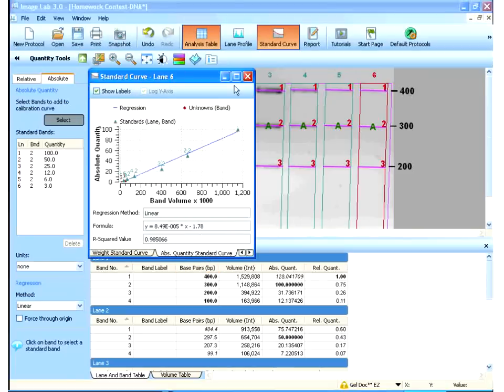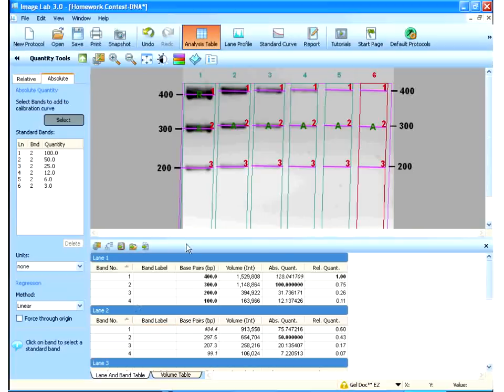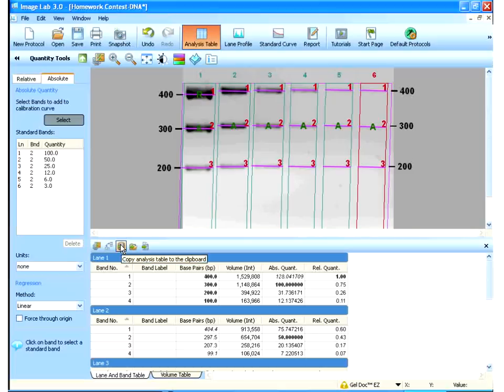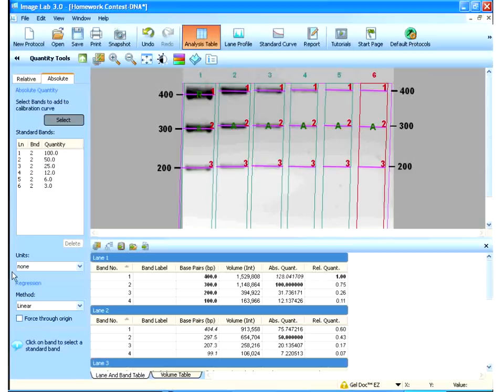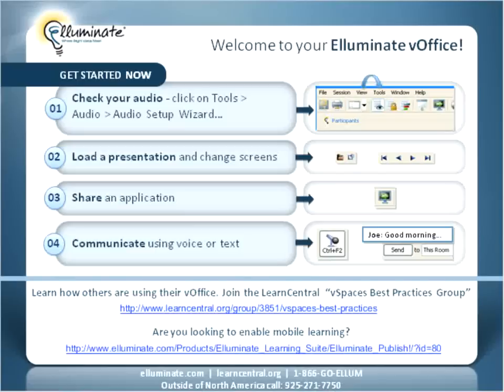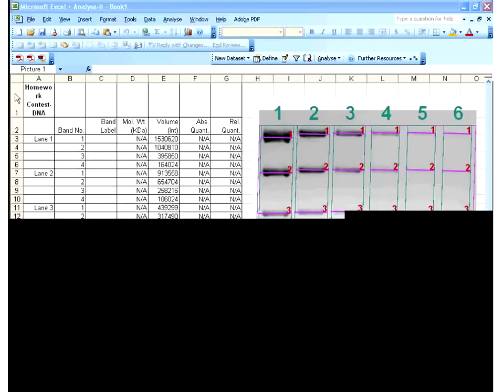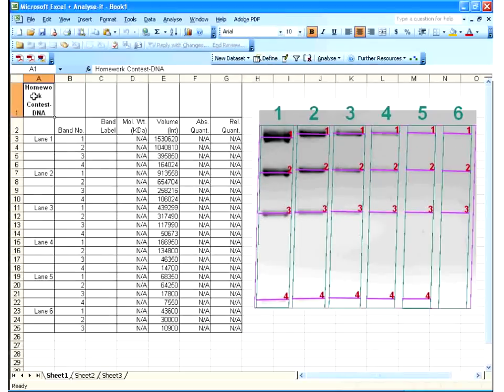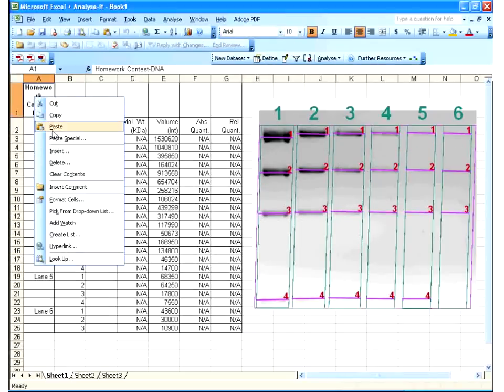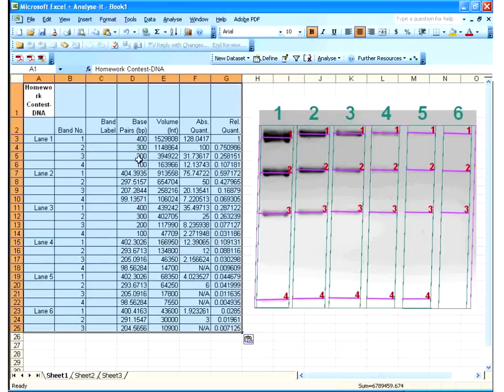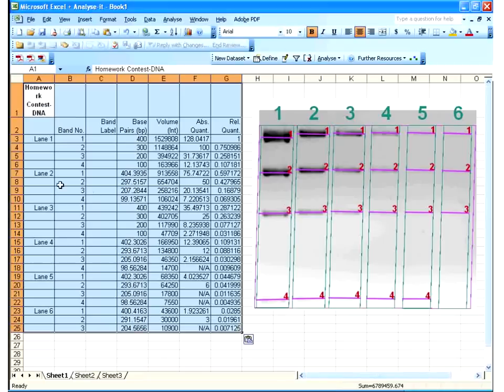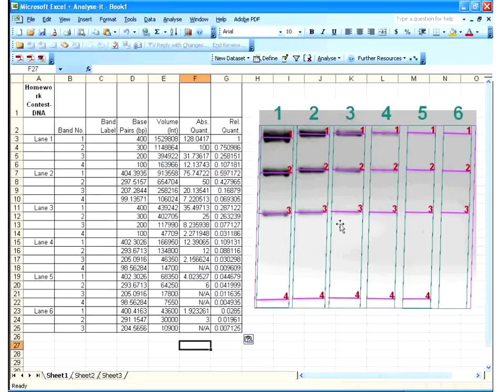So, now I've populated my analysis table, as you see here. Again, I can copy that to clipboard. And, then I can paste this into Excel. So, back to Excel. And, I'll just share that here so you can see what I'm doing. So, here's Excel. I'll repaste that information. And, now I have the volumes, the molecular weights, absolute quantity, relative quantity. I have my gel image with lane numbers and band numbers. And, I have my data. So, everything is in one place, nicely done. And, that's as easy as ImageLab works.